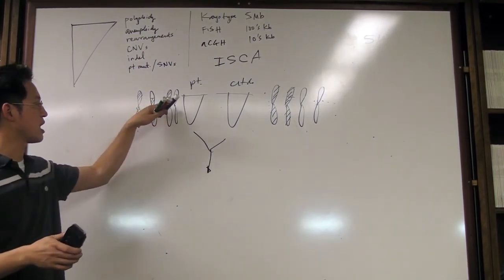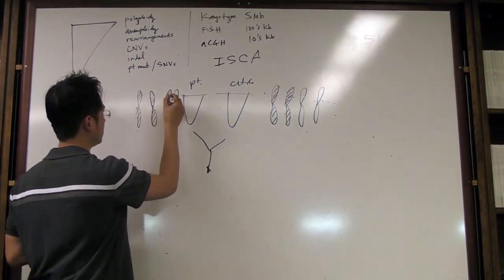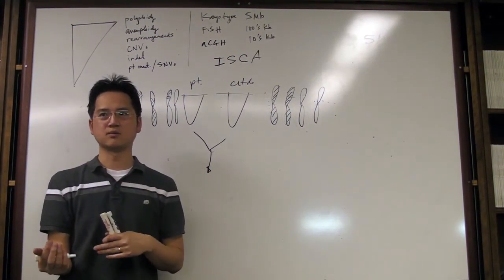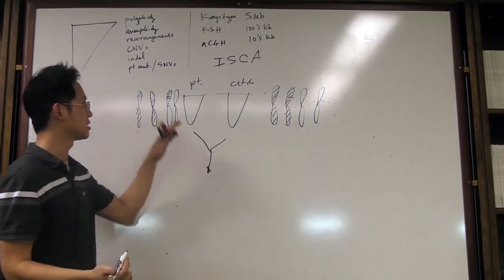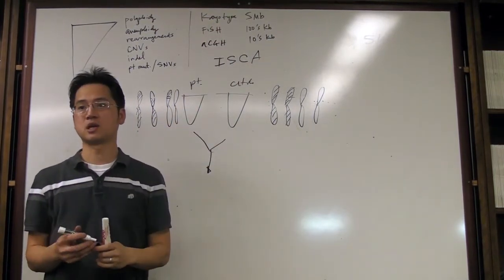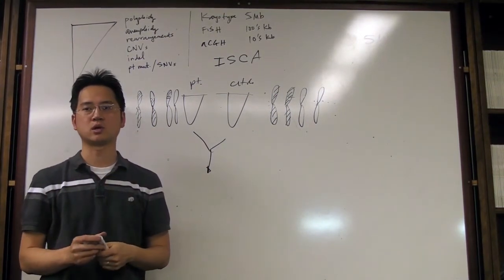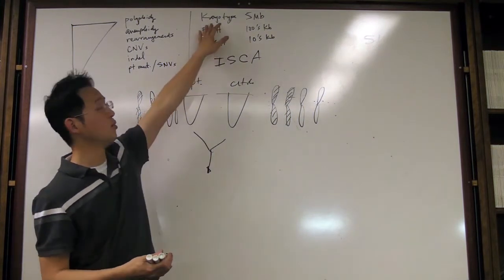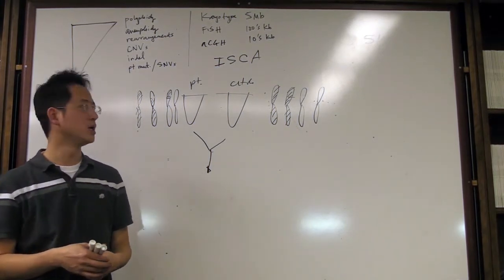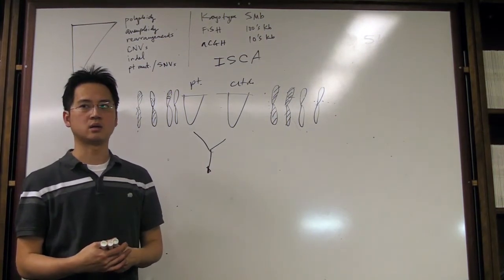Similarly, let's say the patient does have a translocation, and during the process, there is something that's deleted, for example, in one of these chromosomes. So on array, you'll see a deletion. It's an artifact of the translocation, but it doesn't prove that there's a translocation. So typically, if you suspect a translocation based on array CGH results, you need to go back and look at FISH, for example, and design it so that you can detect around that breakpoint whether or not there's a translocation going on. Alternatively, maybe it was on karyotyping, but again, due to the poor resolution, you may or may not be able to pick it up by karyotyping. So for any copy neutral kind of changes, you will not be able to detect it on array CGH.